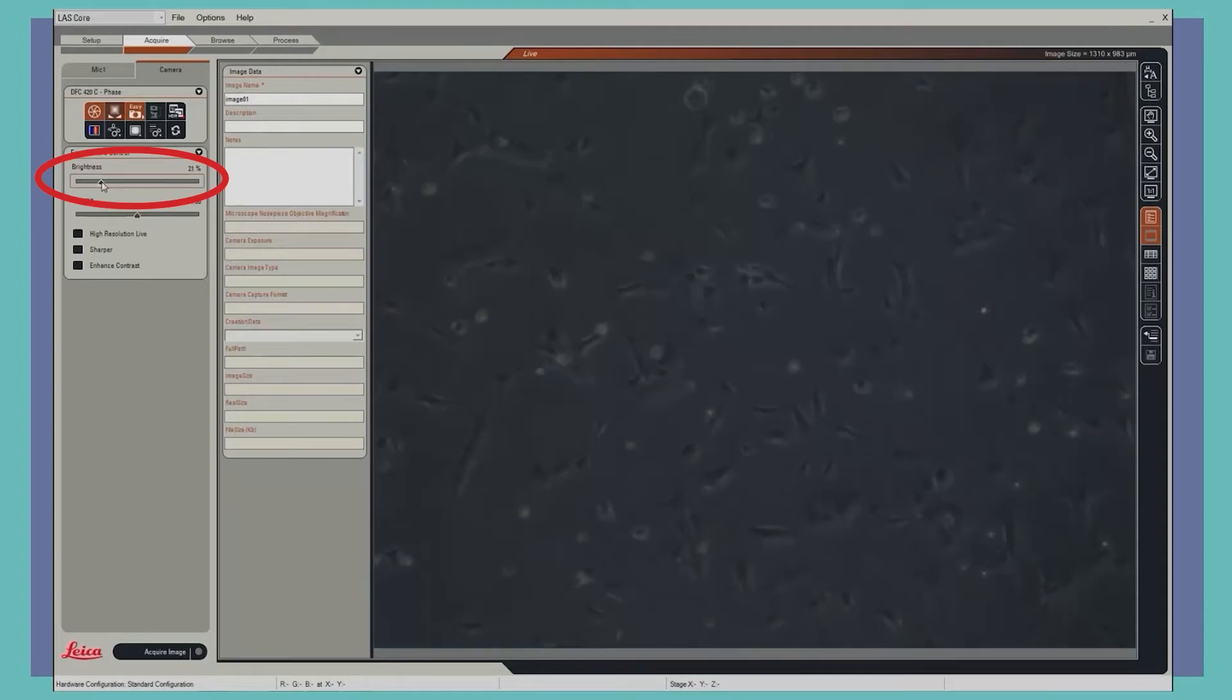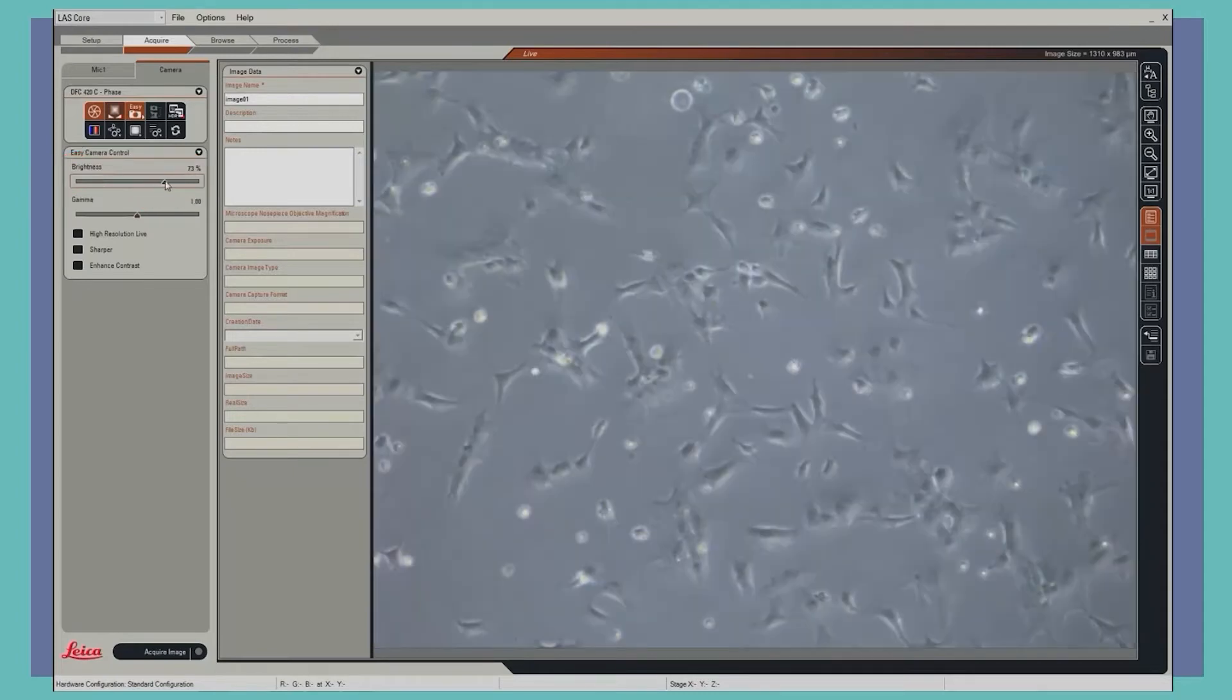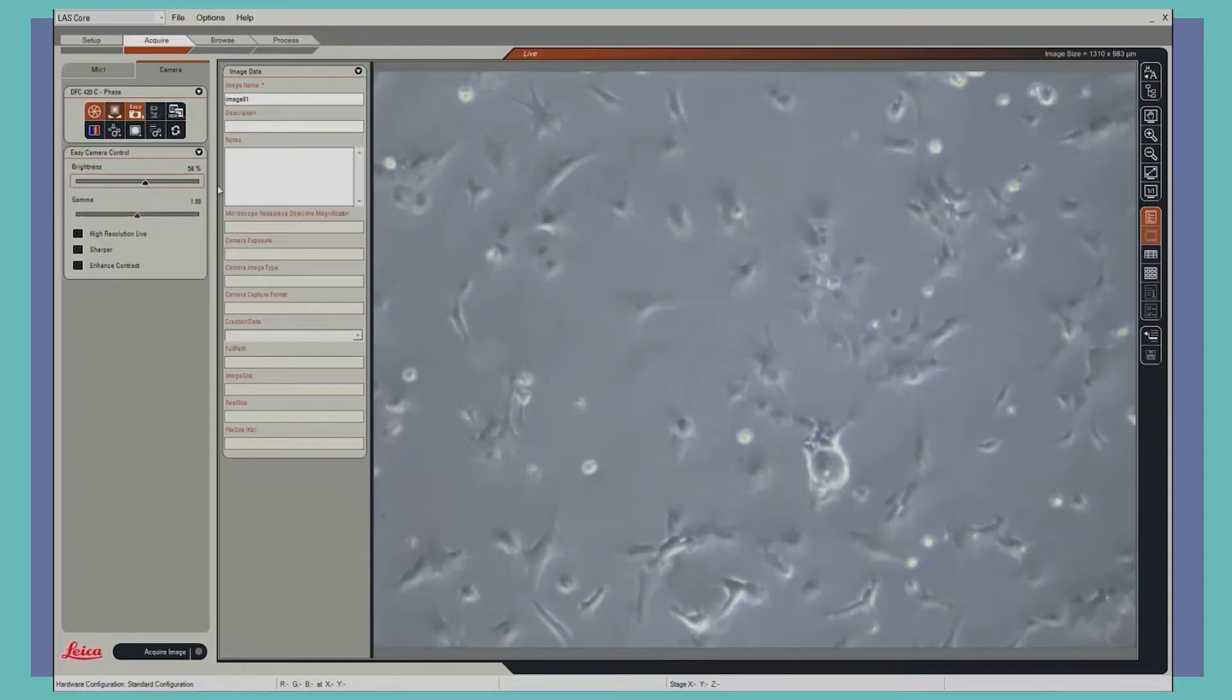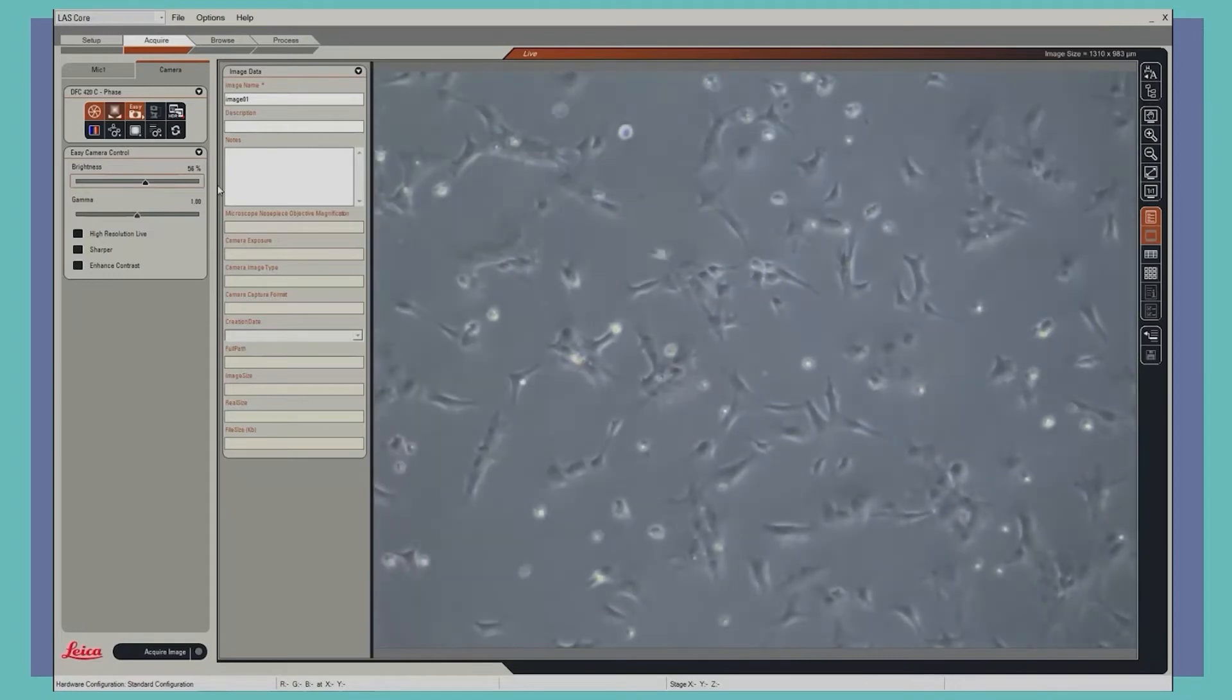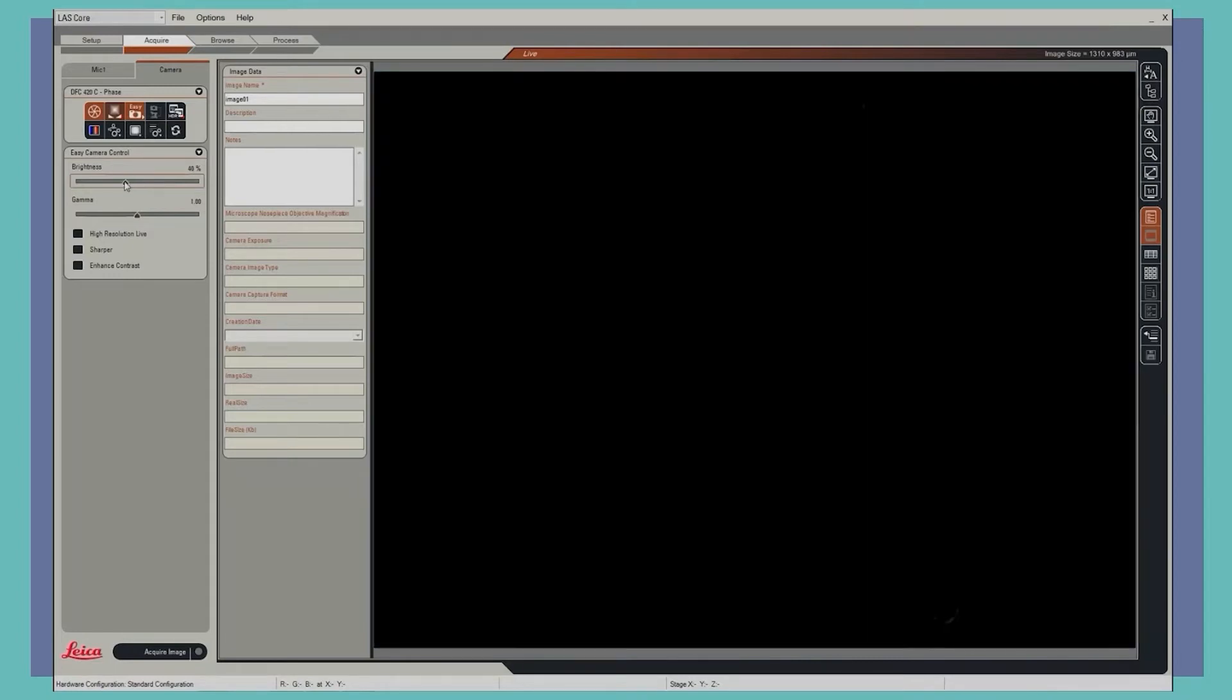We can also adjust the brightness of our image on the interface or the microscope. This helps us visualize different regions. You can also move the stage as shown previously to look at different regions of interest around your cell culture.